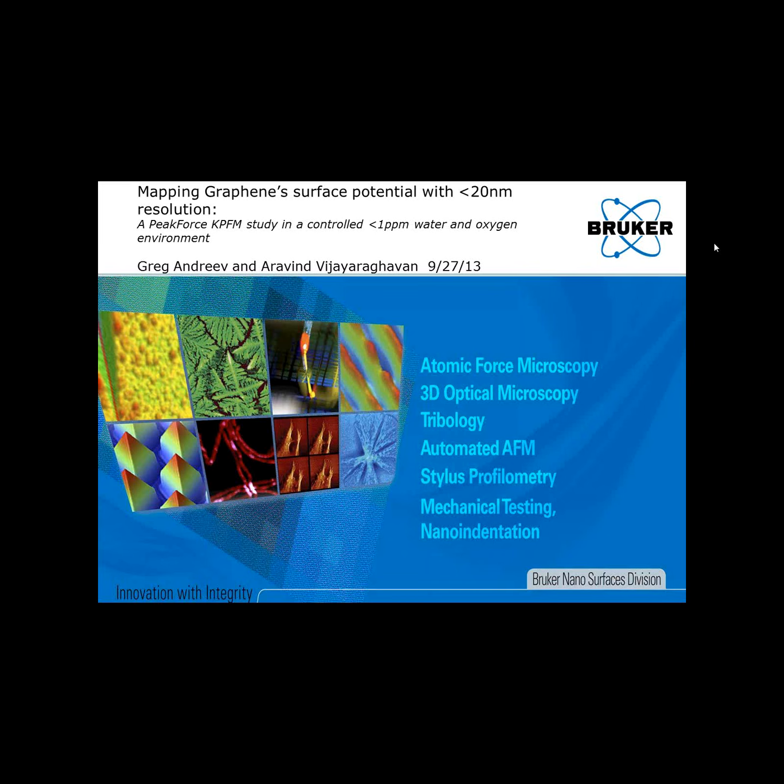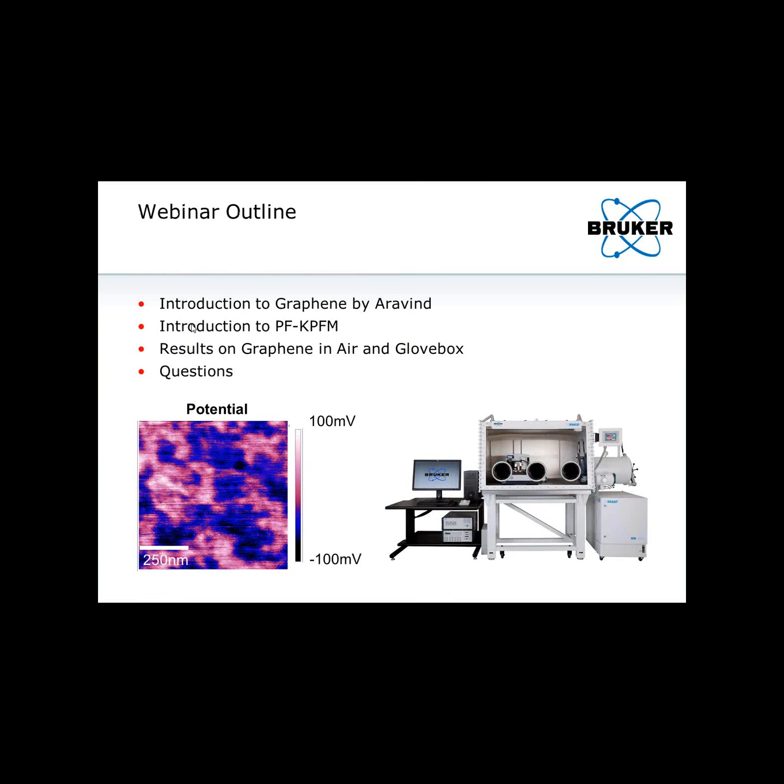All right, thanks, Steve. This is Greg, and let's get started. I will begin with a quick outline of the presentation. We will first have an introduction to graphene by Aravind, and then after that I will go into how PeakForce KPFM works, and then I'll show our results in both air and the GloveBox environment, and afterwards we'll open it up for questions. Okay, let me hand it off to Aravind.